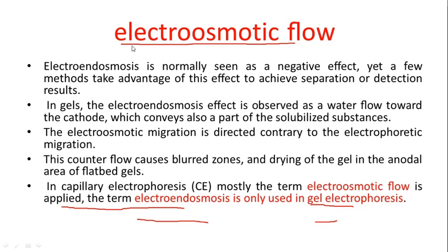Okay. Now we are going to electroosmotic flow. This is another terminology we use at the time of capillary electrophoresis.